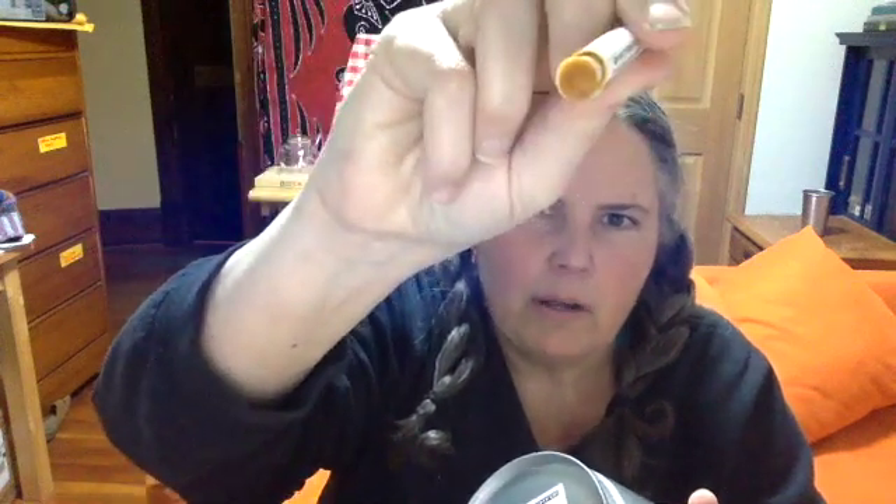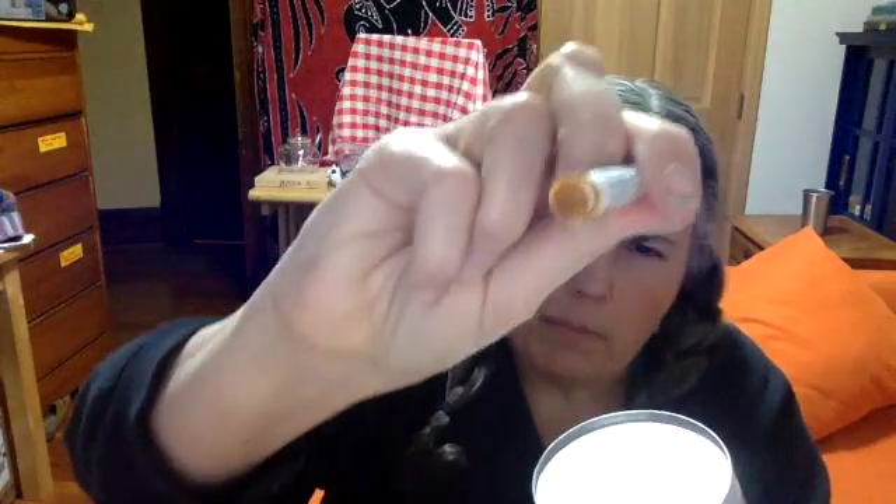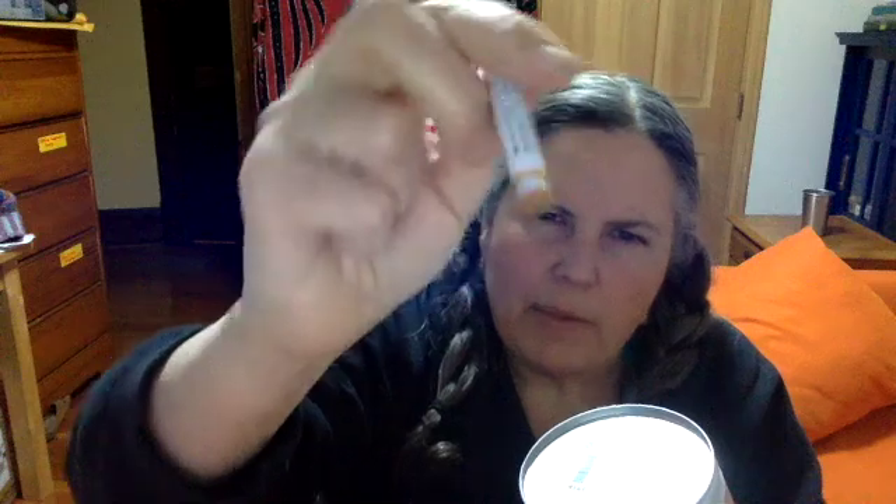What I want to show you is how there can be misreads. It's looking dark — it's not looking pink. Compared to other tests, it's looking dark. Some people misinterpret the hint of pink in this to mean there's lead, but there isn't. It's really more like a dark orange. So I just want people to know that if it's zinc and you're using a lead check brand swab, it should test negative.